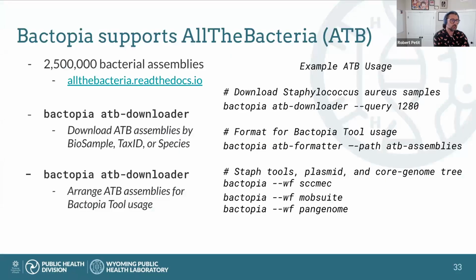And so to me, it's quite nice to say, hey, we have all these assemblies. Can I just integrate them into Bactopia? And so what we did is we created two functions. Bactopia ATB downloader will go and download all the bacteria assemblies, and you could do this by biosample, tax ID, or species.